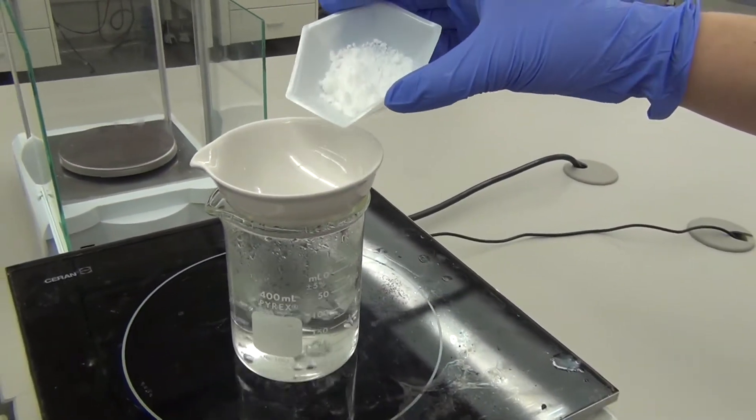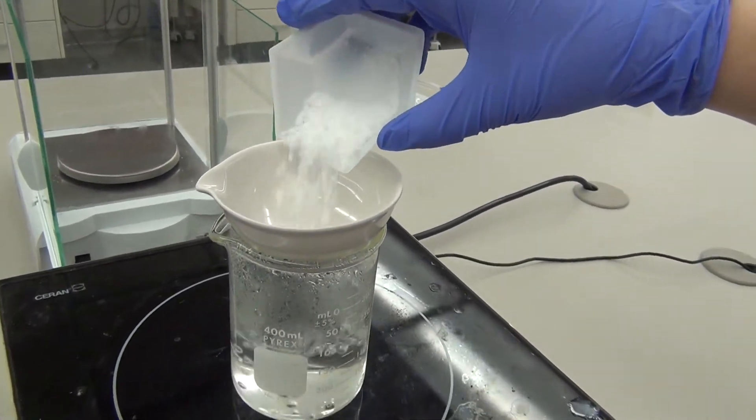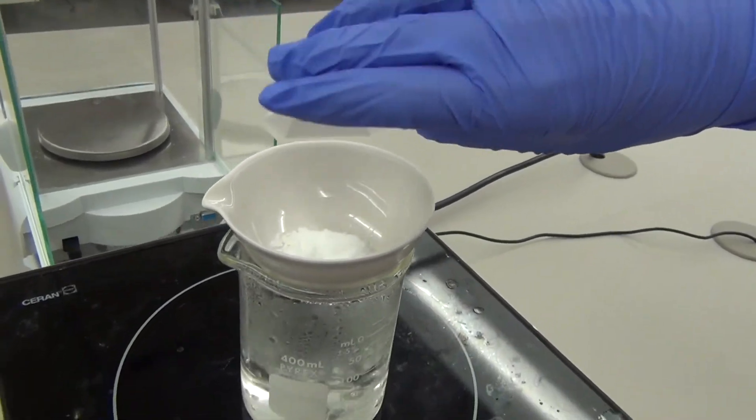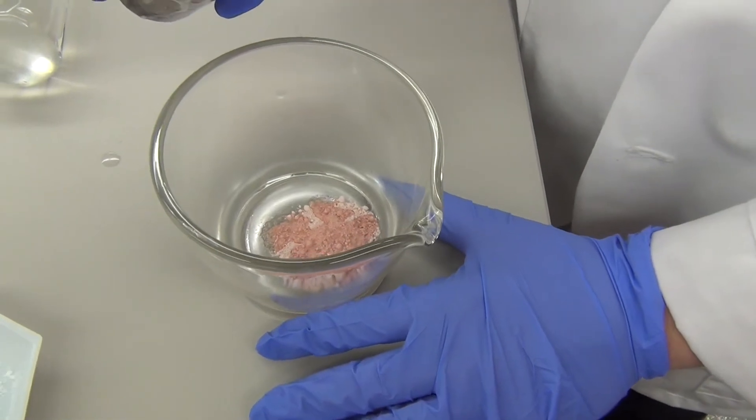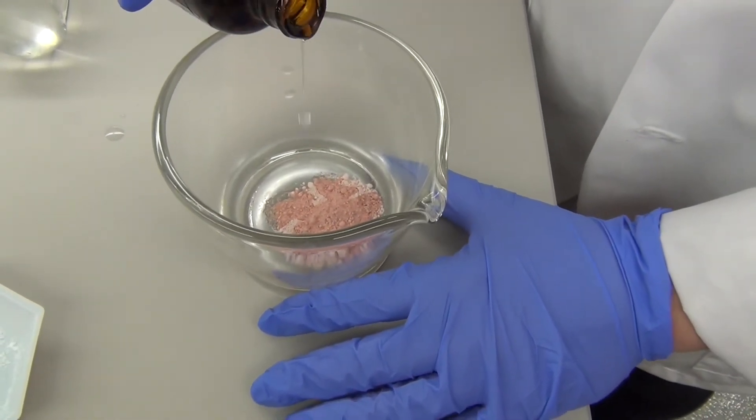For step seven, you are going to combine the fatty blend with the drug. Place the evaporating dish over the water bath and add the first aliquot of fatty blend to the dish. This is going to be the four-gram aliquot. While the fatty blend is melting, go ahead and levigate your drug.